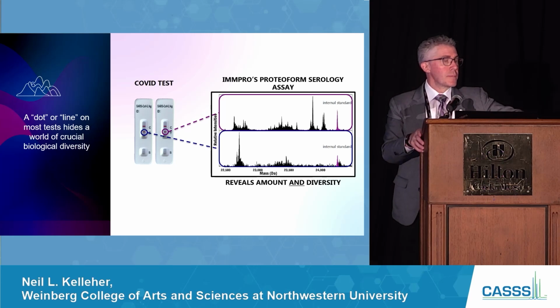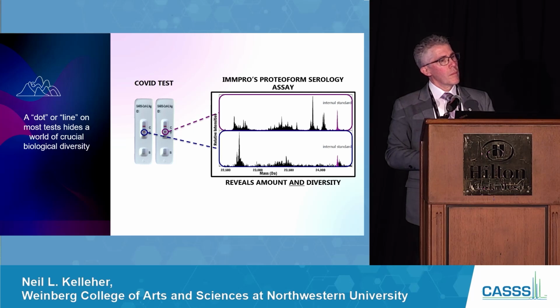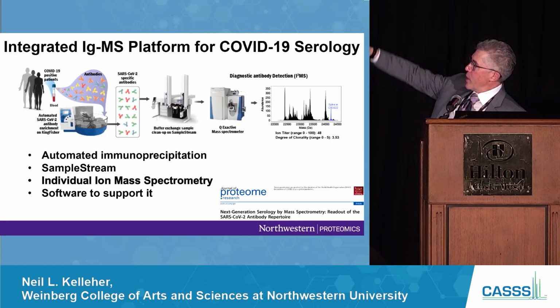Yeah, I guess in my mind I was thinking that your ability to see clonality requires you to essentially dilute down your sample, right? You mentioned that in order to even achieve it, you had to reduce it to about 20%, to even see those. I was just wondering if you're preferentially looking at high responders, and whether it's just that you have a series of really low ones, so that your population is more complex. Fair point. The degree of clonality, we have to be able to see it.